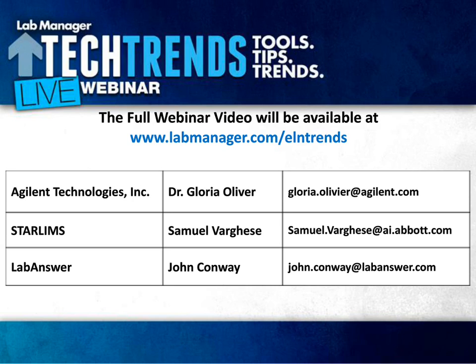Great, thank you. John, you showed a table that said that LIMS were highly structured and ELNs were free-form. However, an analytical ELN is highly structured. Why is that?